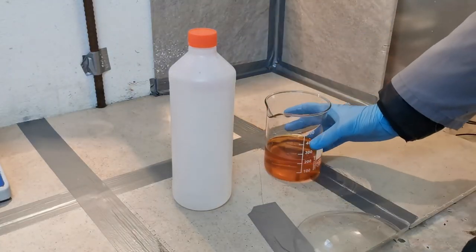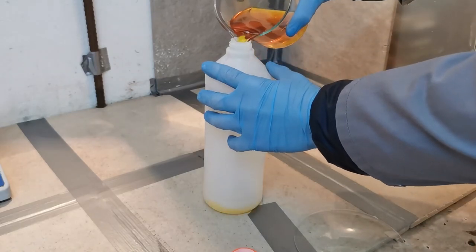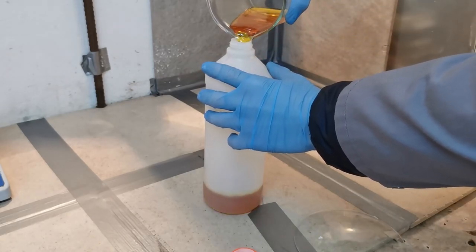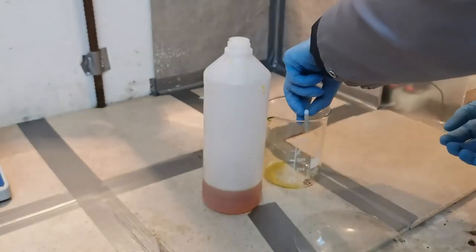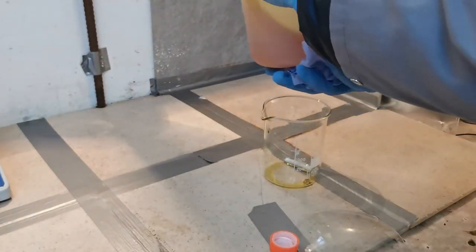The solution is also quite stable in storage. The higher the sodium hydroxide concentration, the less hydrogen sulfide is evolved. To prevent the formation of long sulfur polymers, it should be somewhat protected from light. That's basically it for this video.